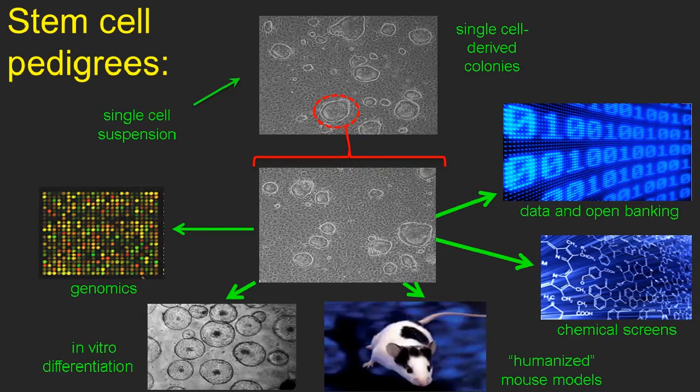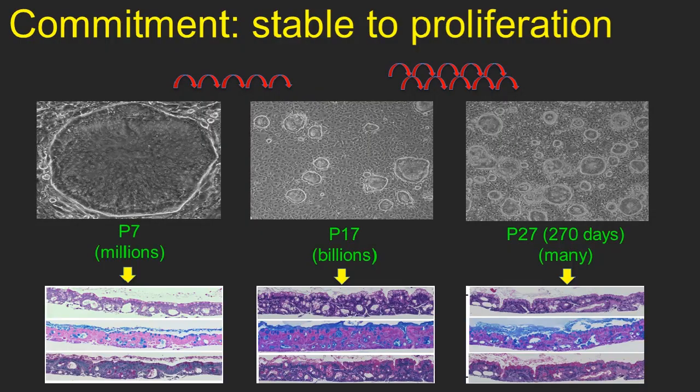And this is probably the most important slide in just this notion that you can take a single cell suspension, derive a library of clones from this, sample an individual clone, and because they're intrinsically immortal, you can expand these to unlimited numbers. That allows you to ultimately do parallel studies with genomics or any of these other information gathering systems, and they will all read back to that same single cell. And so this is powerful. It's a simple slide, but I think it sort of underscores the value of the system.